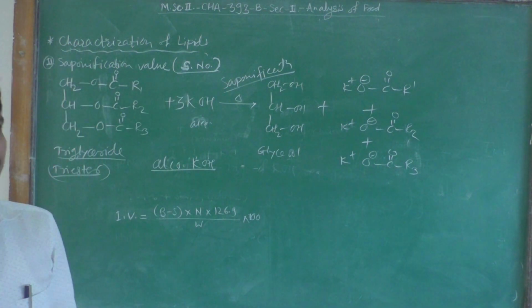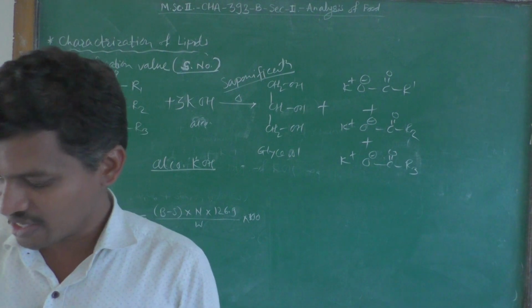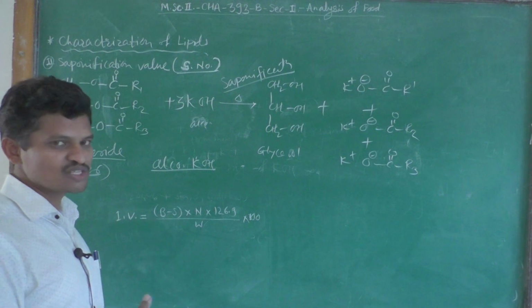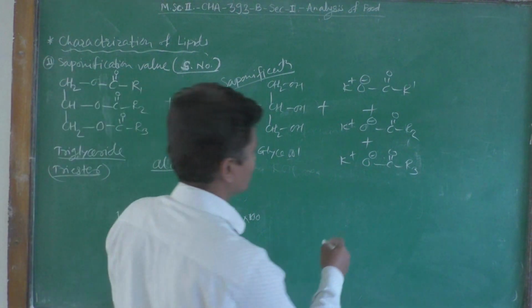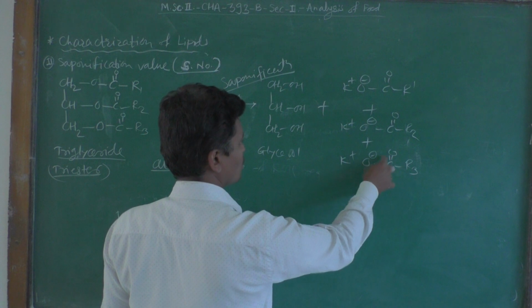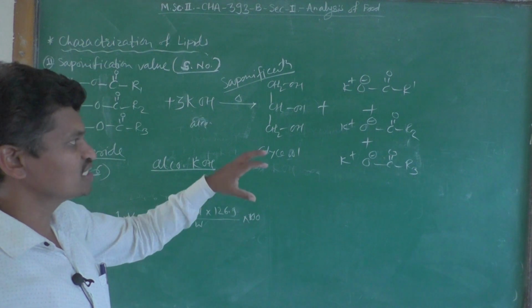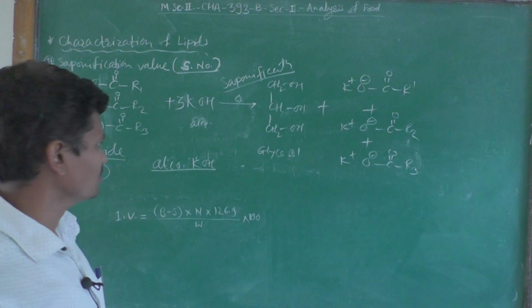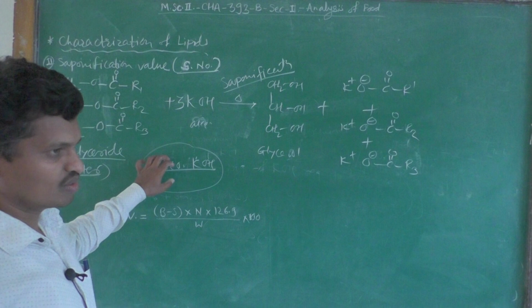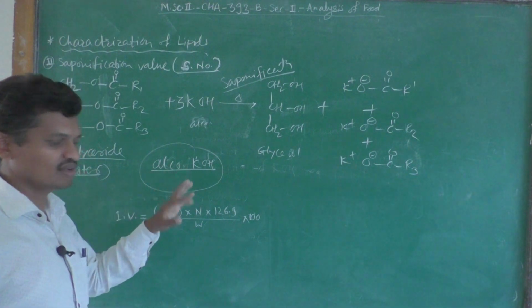are titrated with a standard HCl solution, the HCl solution having fixed normality. This is nothing but a salt, and in acidic condition it will be converted into RCOOH, that is, converted into fatty acids, and these acids are then titrated with the HCl. So the remaining KOH is then titrated with the HCl, and then the calculation is done.